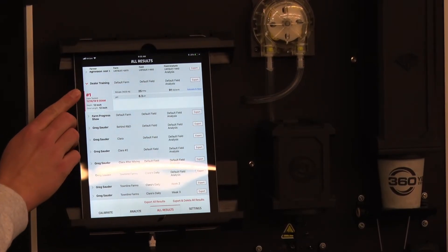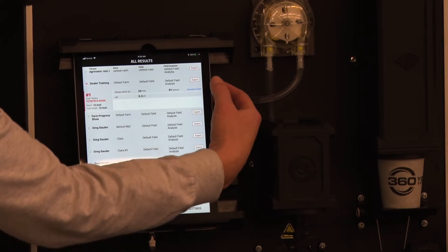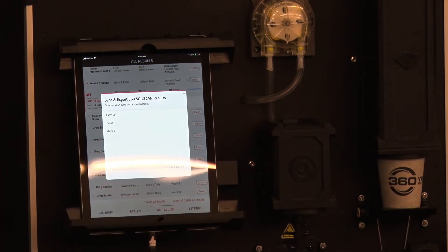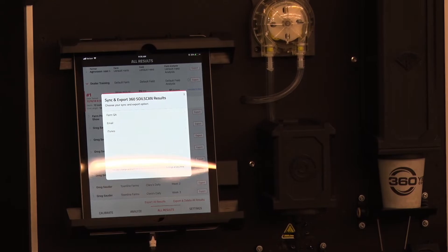You can export all of the results from the same farmer by selecting export next to their name and emailing it same as you did before.